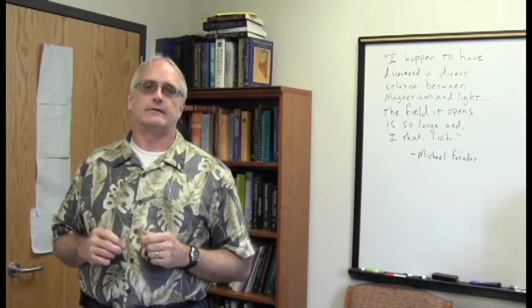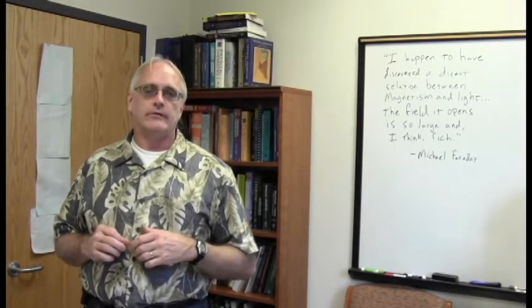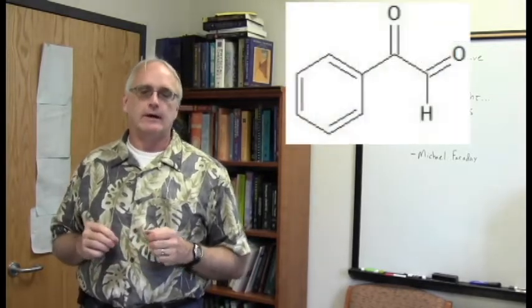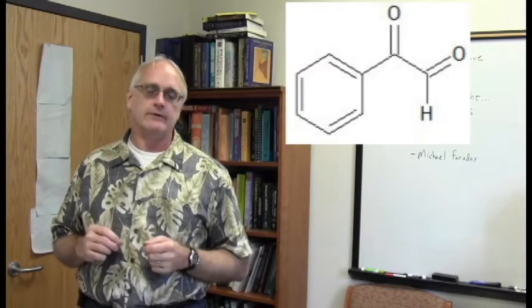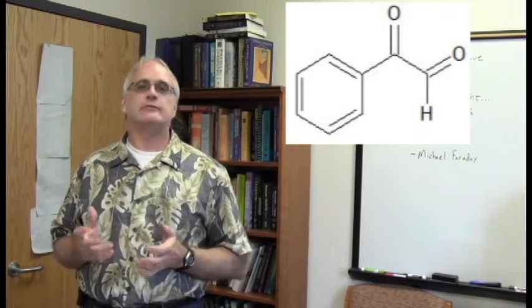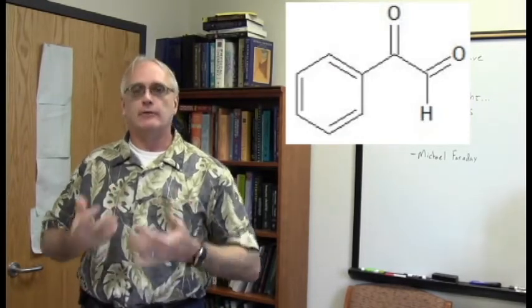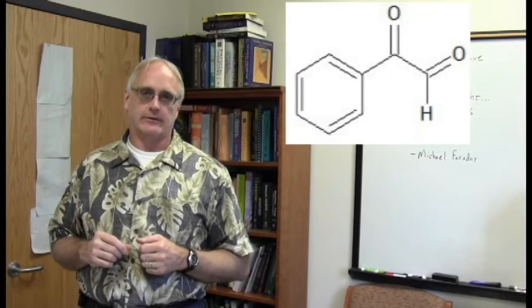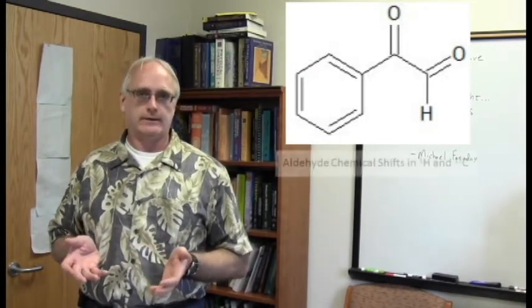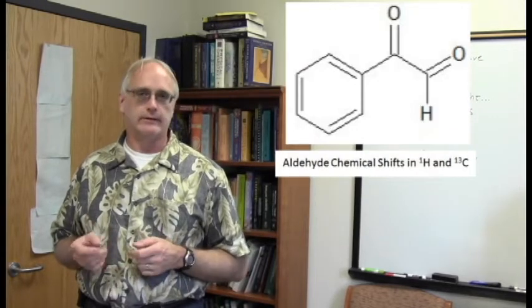The structure of phenylglyoxal is a relatively straightforward one. And so when we looked at the structure, I made an inventory list of what I would have expected to see in both proton and carbon spectra, just to confirm that, knowing the sample history, here's what we would expect to see in our spectra. And the thing that just jumps out at you is the aldehyde hydrogen. We should see chemical shifts of an aldehyde in both proton and carbon.